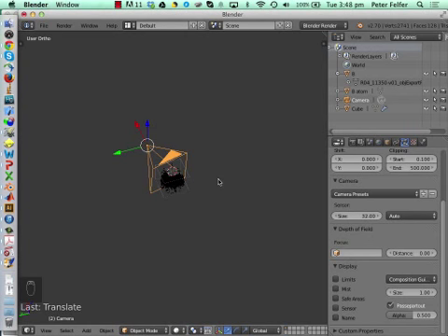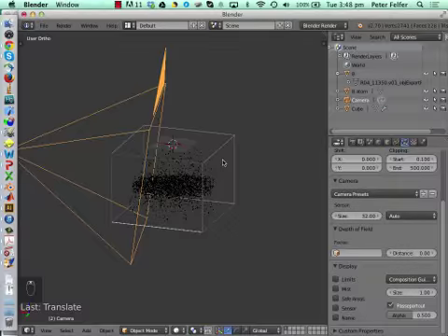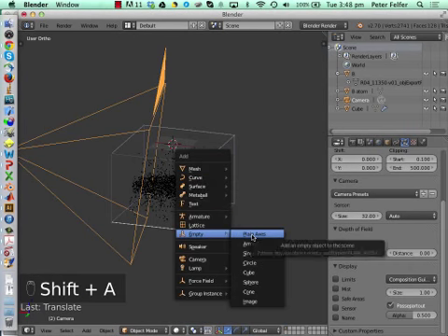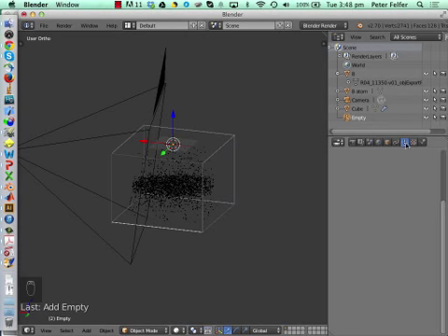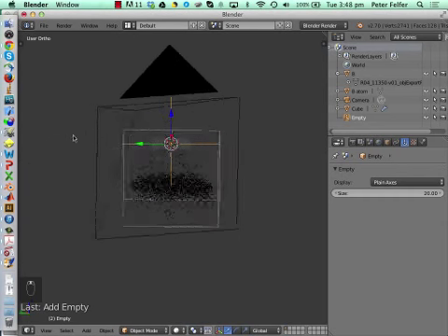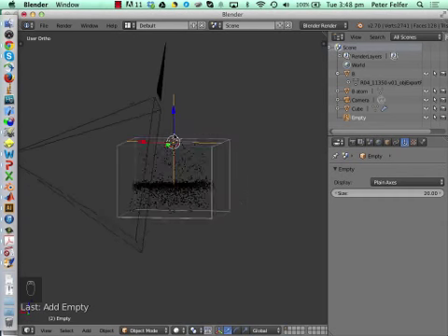Because that means we can use constraints for the camera, so it will always point to exactly where we want it to point, and we can always rotate it just with this one control object, and it can make very nice animations in no time at all. And such a control object is usually an empty object. So just go empty, plane axis, and it's right there. The only thing with the plane axis, we'll make it a little bit larger. We'll make them 20, so you can see that 20 nanometers large now.